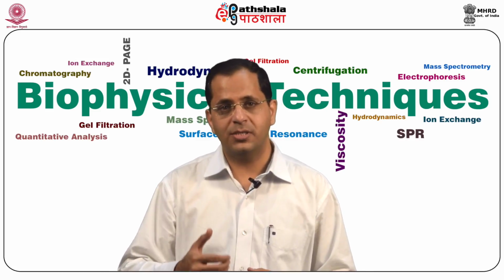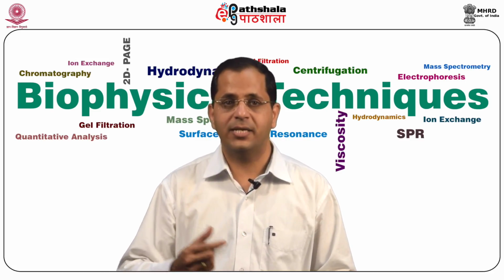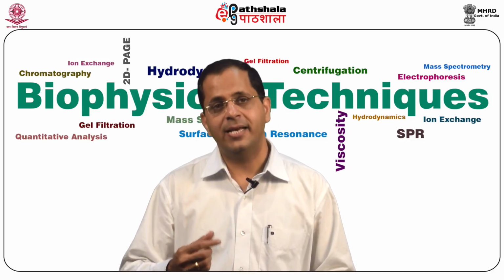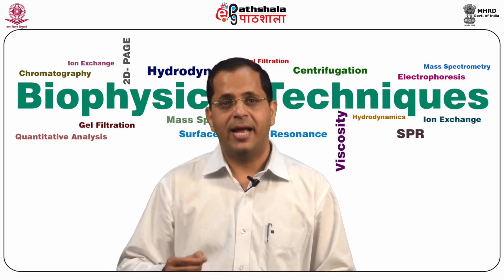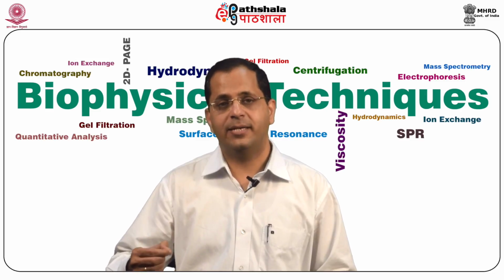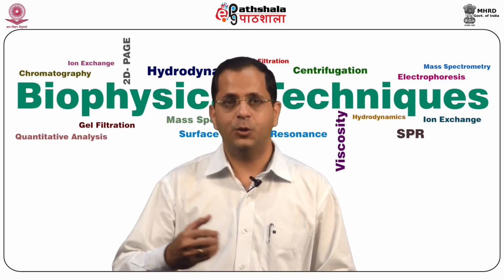DIGE also uses a technology of labeling proteins with cyanine fluorescent dyes. Also, importantly, it incorporates an internal standard, which is the pooling of all samples in an experiment and is run on every 2D DIGE gel in that particular experiment. Modifications of 2D.